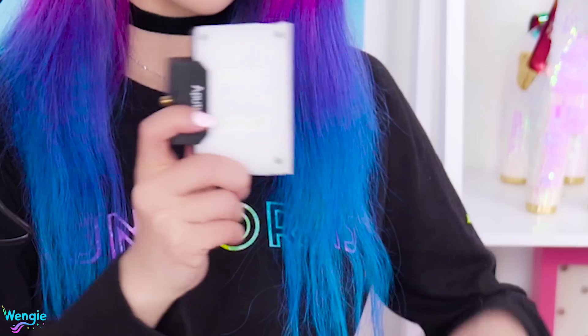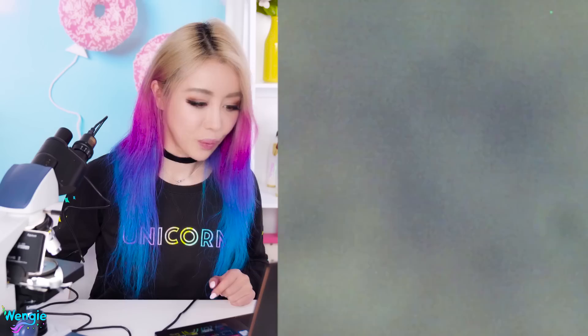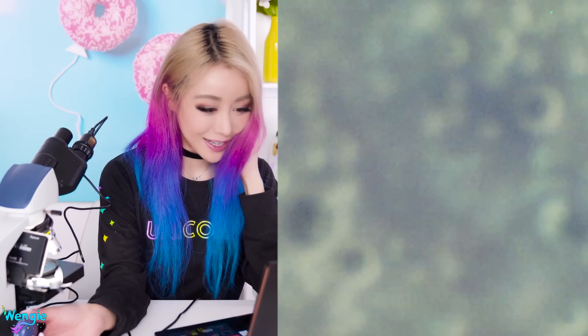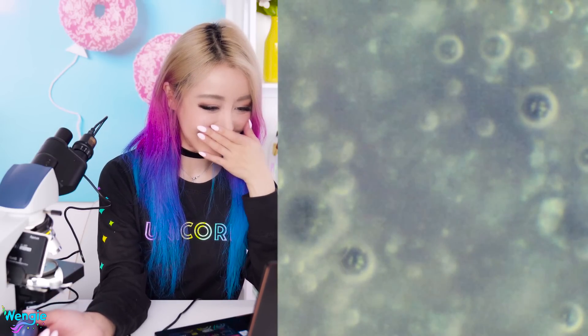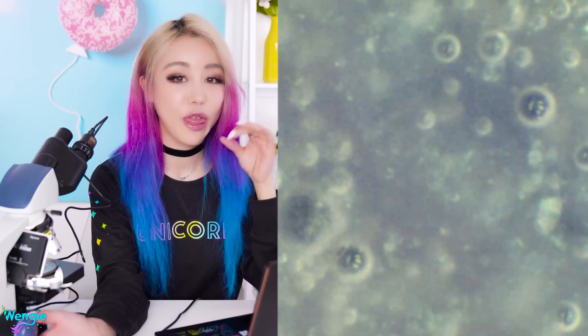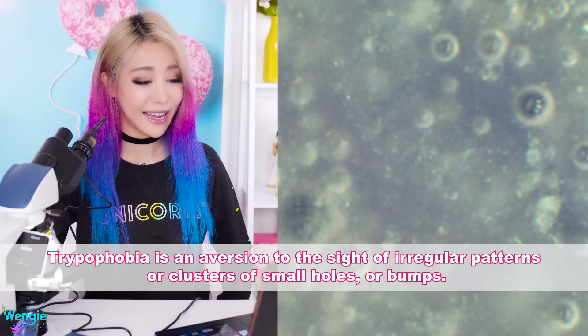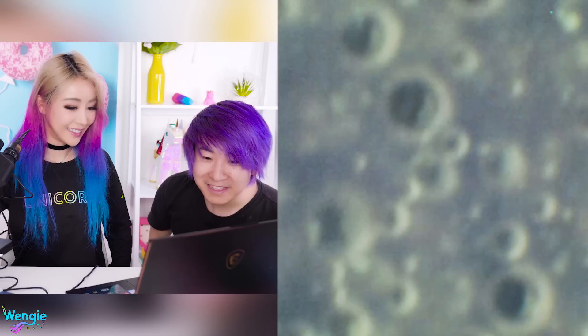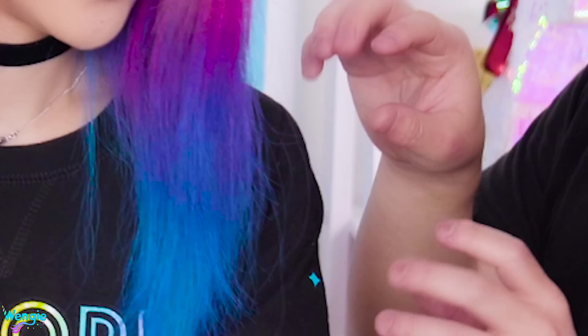So I decided to be super DIY and found a camera light to shine on the top to see what it looks like. We see blurry purple things. Maybe I need to adjust the dial. It's becoming clearer — yuck! That looks disgusting! It looks like a whole bunch of eyeballs that someone threw up. I've got some trypophobia happening and this is making me really uncomfortable. That's gross! Look at that — notice how disgusting that looks? Does that look like dead skin? They look like little alien eyes.